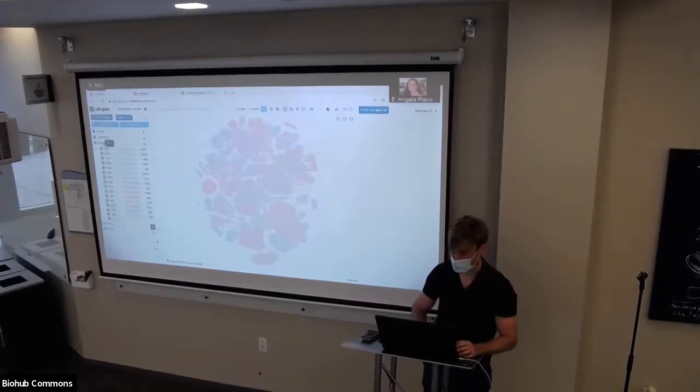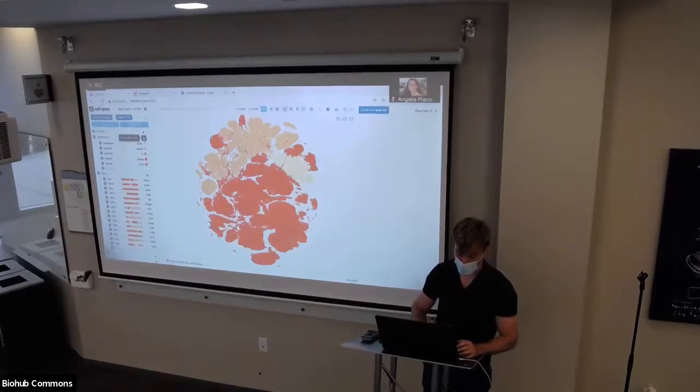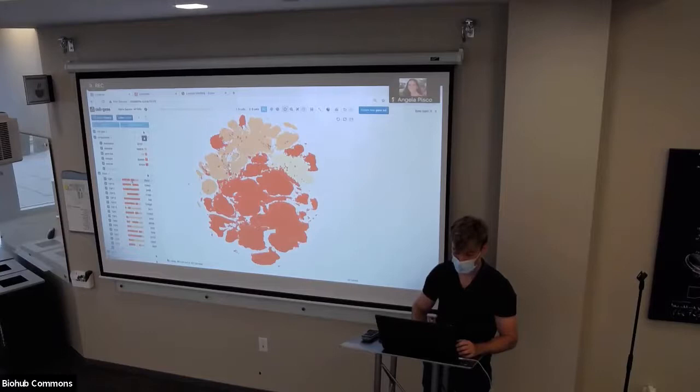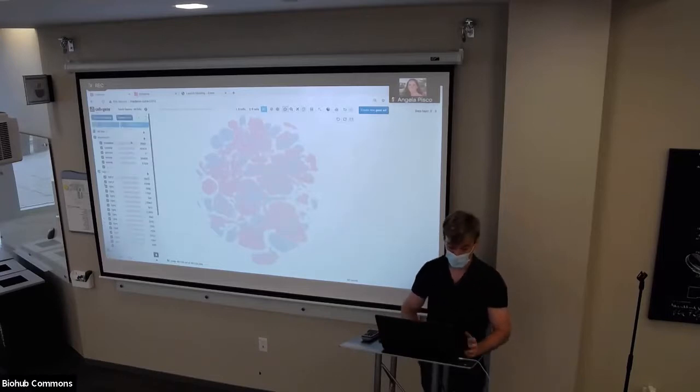They're nicely mixed. Thank you, batch correction. We have the donor themselves. We have cell type compartments. And by the way, I forgot to mention these stacked bar plots here show you, within TSP1, what is the composition of their compartments? Because we're currently coloring by compartments. We can also color by sex, for example, and you see that each donor is just one color because each donor is one sex. Same for cell types.